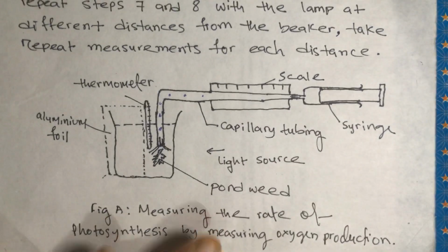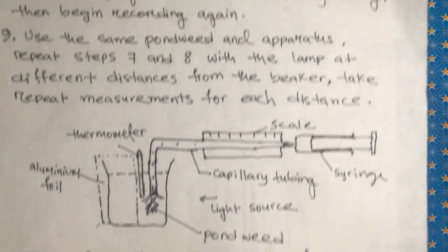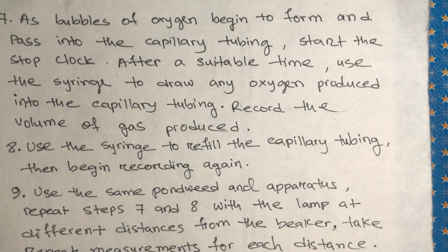Okay, and this is how the experiment is done, and this experiment is repeated several times with different light intensities to make the experiment more reliable.